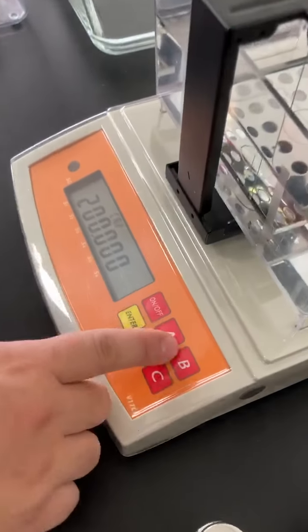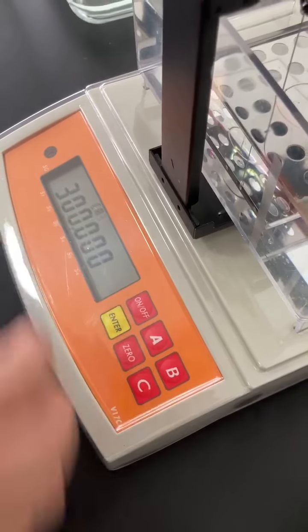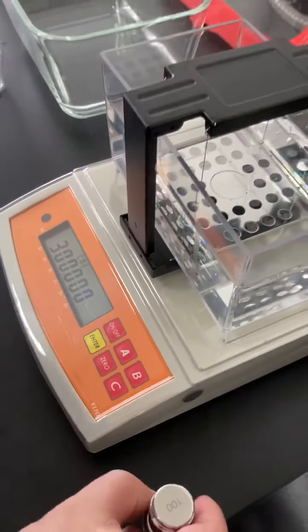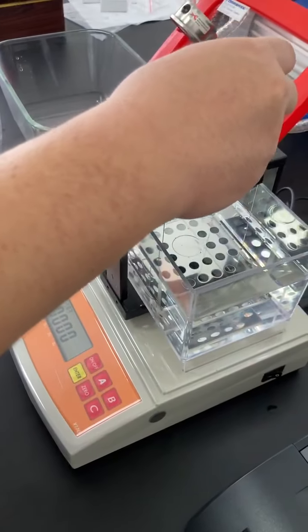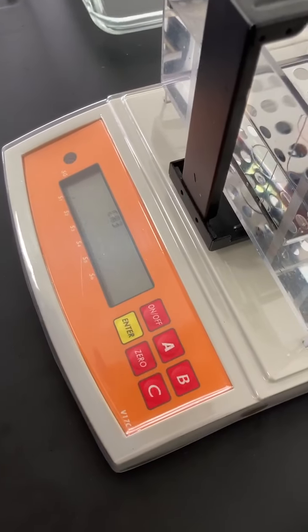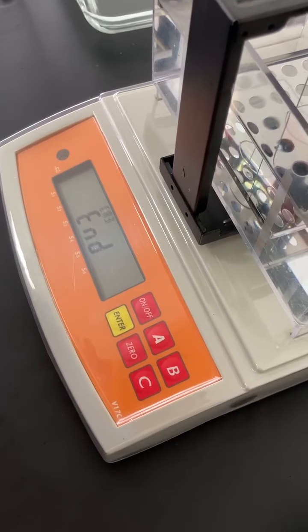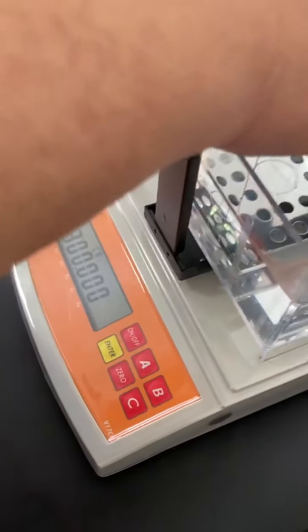Press button A to CA3 — 300 — and put the 100g weight and 200g weight here together, then press enter. Now it's over.